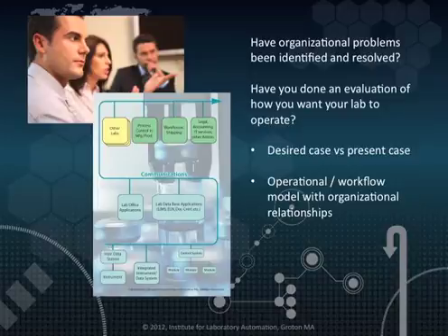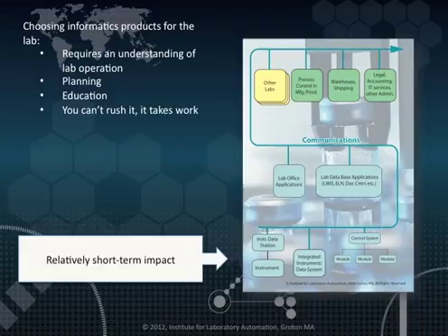Do an evaluation of the laboratory's operations. Take a look where the laboratory really needs to go, where it is now, and map out a plan to get where you want to go. Use operational workflow models to map out not only the lab's workflows, but how those workflows interact with other groups. This last point can be used to build support for your proposed programs.